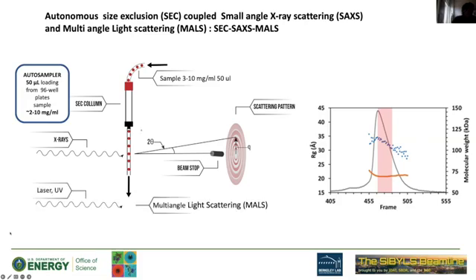And so that is not only the end of the data collection, we're also collecting multi-angle light scattering, and why it is important. This is an example where we have a nice single peak from size exclusion, and because we're collecting both SAXS and MALS, we can overlay those detectors and see across the size exclusion elution peak. For each frame that is collected every 2 seconds, you see the radius of gyration drop from about 35 to 28 for this particular protein. However, when we look at the molecular weight, it is more or less stable across the elution peak. So that's really surprising.